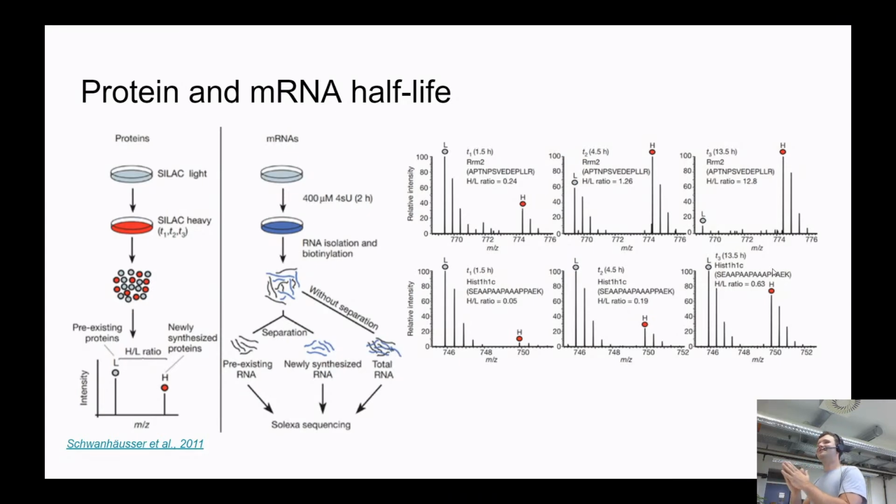You see, this is actually a very important thing. We're kind of looking at expression as a static picture, but of course it's not static. Some proteins are heavily synthesized and destroyed. This can be very important for certain regulation. We can also measure this for RNAs; there's another technique to measure the half-life of RNAs. It's not actually very complicated, but measuring two things simultaneously was the distinguishing feature of this paper. I totally recommend you read this paper. In many senses it was a breakthrough in the field.